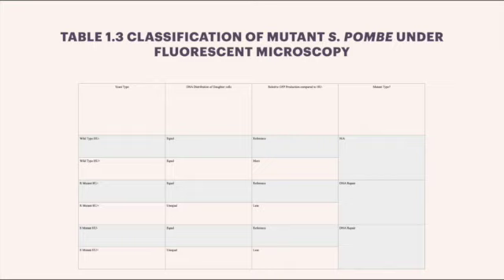For the R mutant, in HU minus, you will find the DNA distribution of daughter cells equal, while in the HU plus, you will find the DNA distribution of daughter cells unequal. In regards to the GFP production compared to HU minus, the HU minus will be the reference and the HU plus showed less GFP production. With all of these characteristics and classifications, we determined that the R mutant is a DNA repair mutant.